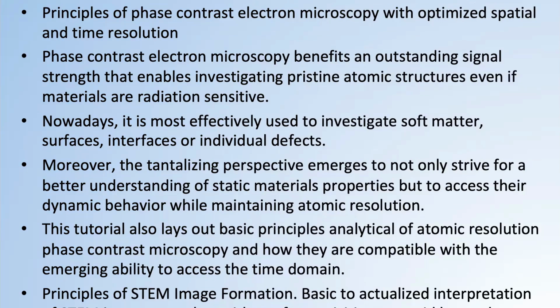Nowadays, this can also be used to investigate soft matter, surfaces, interfaces, or individual defects without moving any of the atoms with the beam. Moreover, the tantalizing perspective emerges to not only strive for a better understanding of static materials' properties, but to access their dynamic behavior while maintaining atomic resolution. This tutorial also lays out basic principles of analytical and atomic resolution and how they are compatible with the emerging ability to access the time domain.